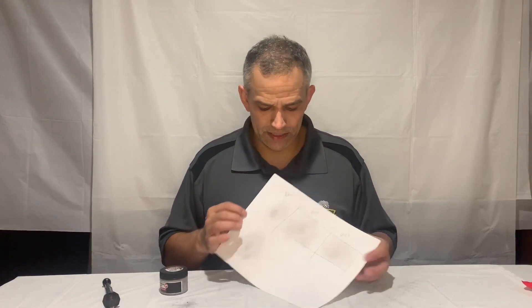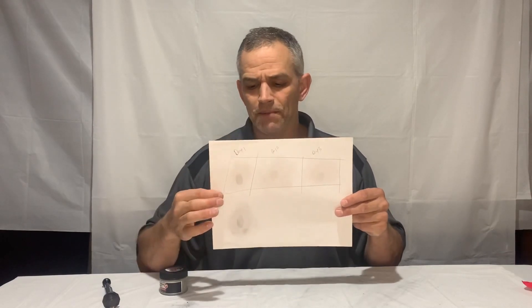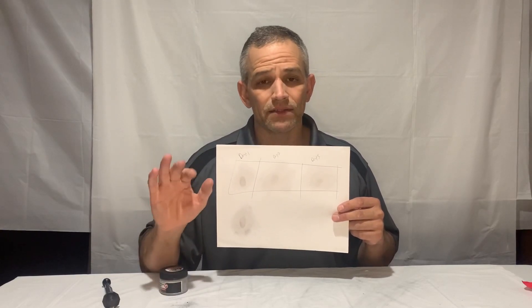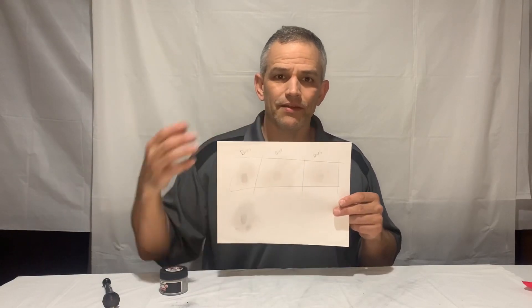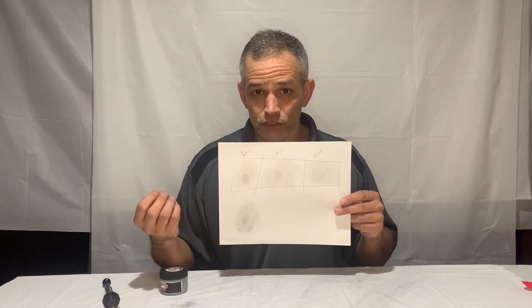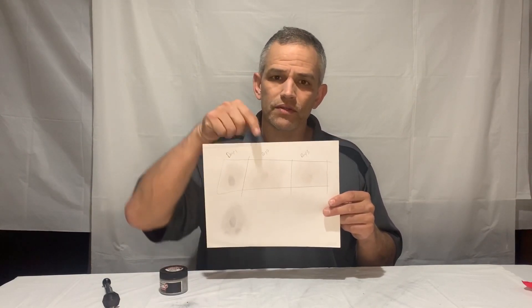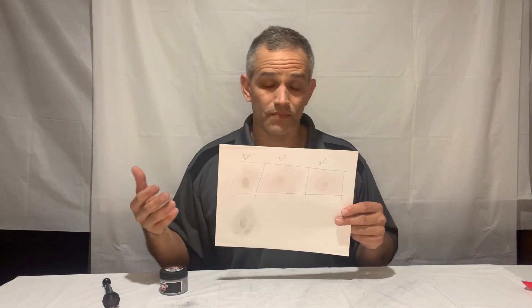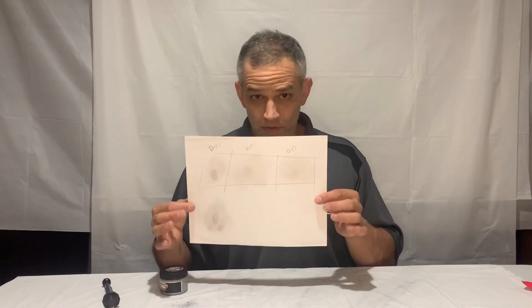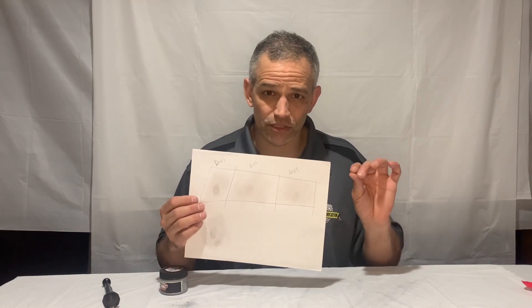What you'll find — you see the print I just put down on the bottom? It's kind of messy. But looking up here: day one, that print is looking fine, lots of detail, a great developed print. Day two — remember that paper is absorbing that moisture — it's starting to dissipate, the moisture is not staying on there, so the day two print is not as great. And by day three, some people didn't even get it. This one was from a student and I did get a few very light ridges, but sometimes by day two you're not going to get anything.